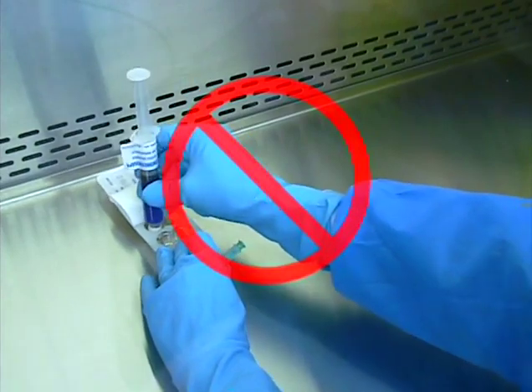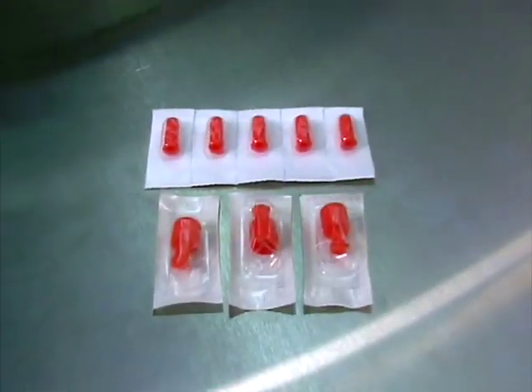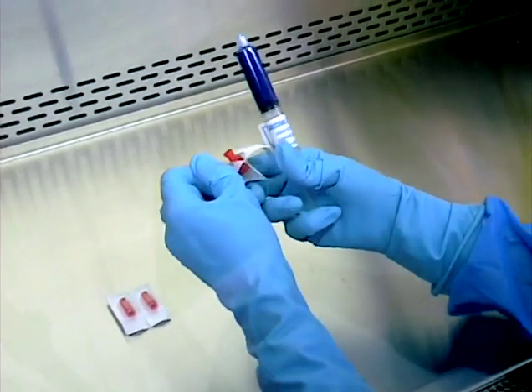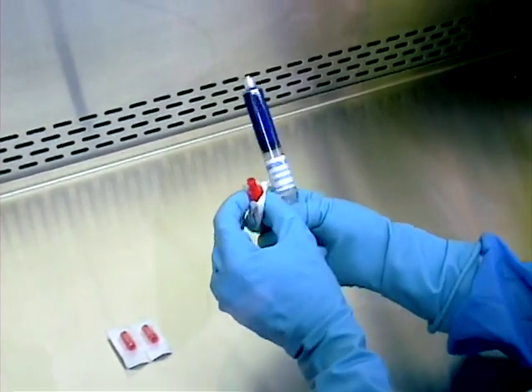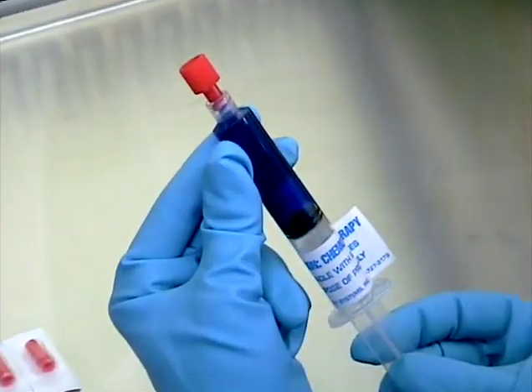Do not use push-on type caps for hazardous materials. Twist-on caps are generally packaged singly, in packets similar to needles. The same technique used in applying a needle should be used to attach this type of cap to the syringe.